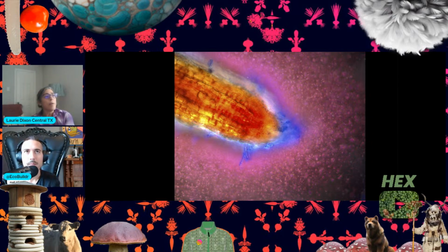And I think right here is a good place to talk about So go ahead. That's darkness there. This is the soil. Yeah. This is a root. This is a root tip in soil. I mean, this is a microscopy, I mean, a slide. So no, the soil's not here, but yeah, this is what happens in the soil. That's the root tip. That's the meristem. This is the rhizosphere. That's what happens in the soil. Okay. And you said it was a good time for us to mention epifluorescence.